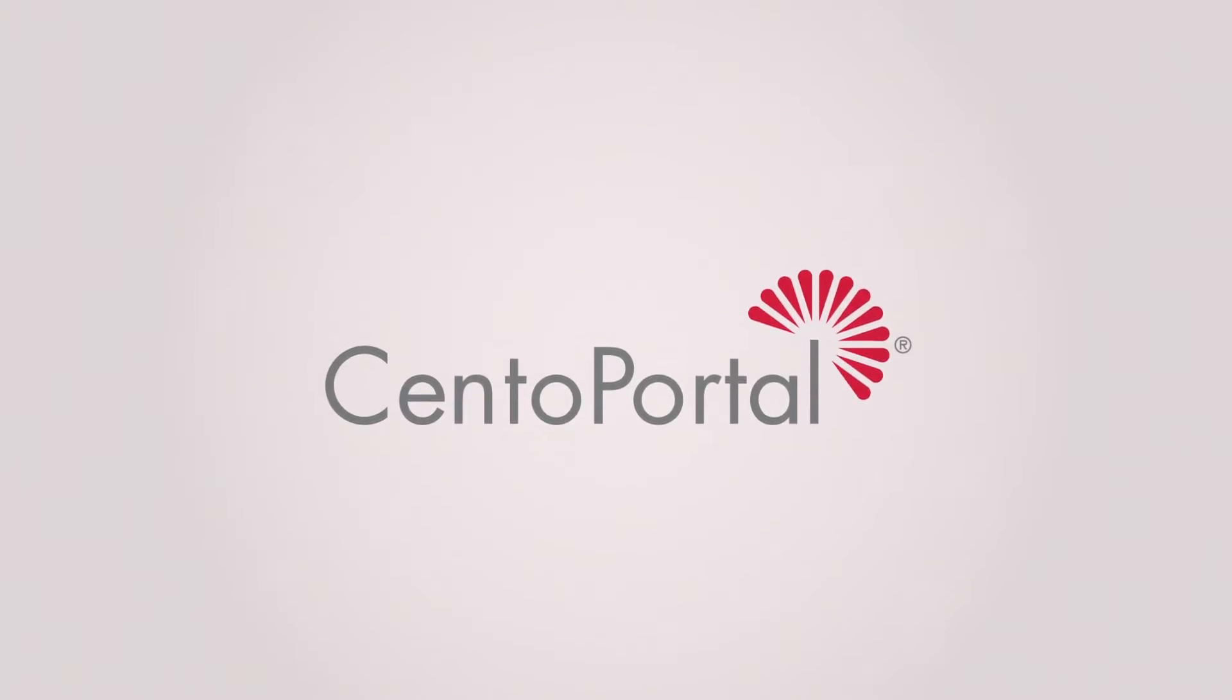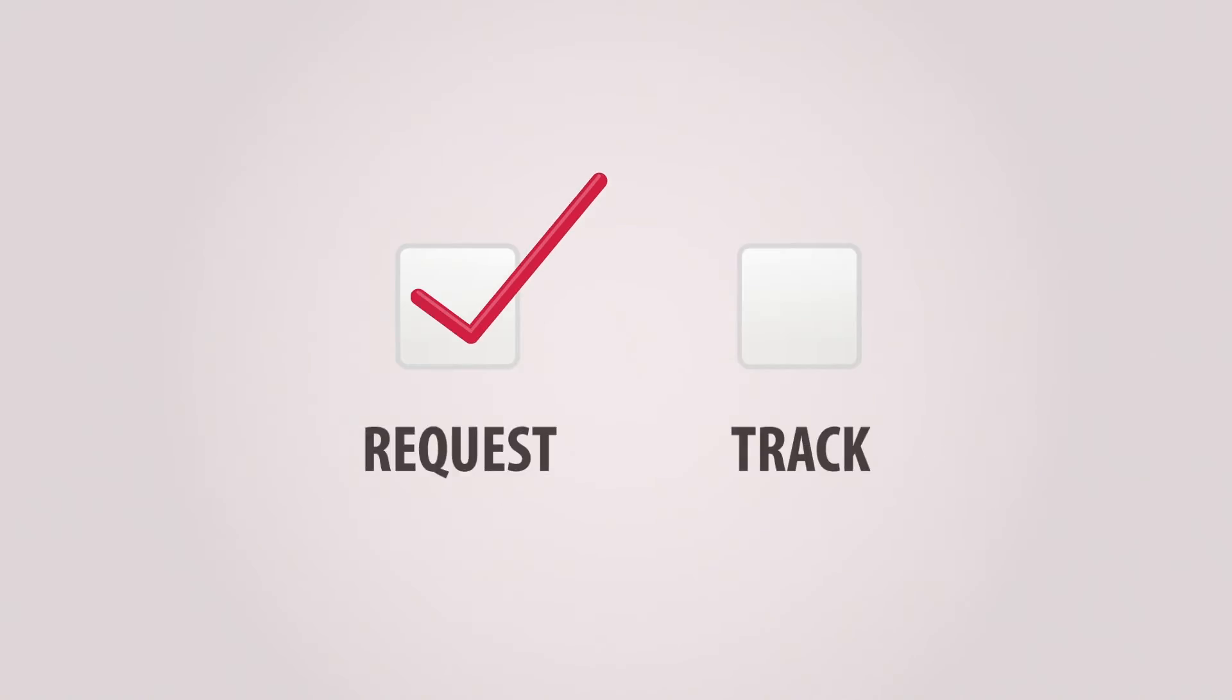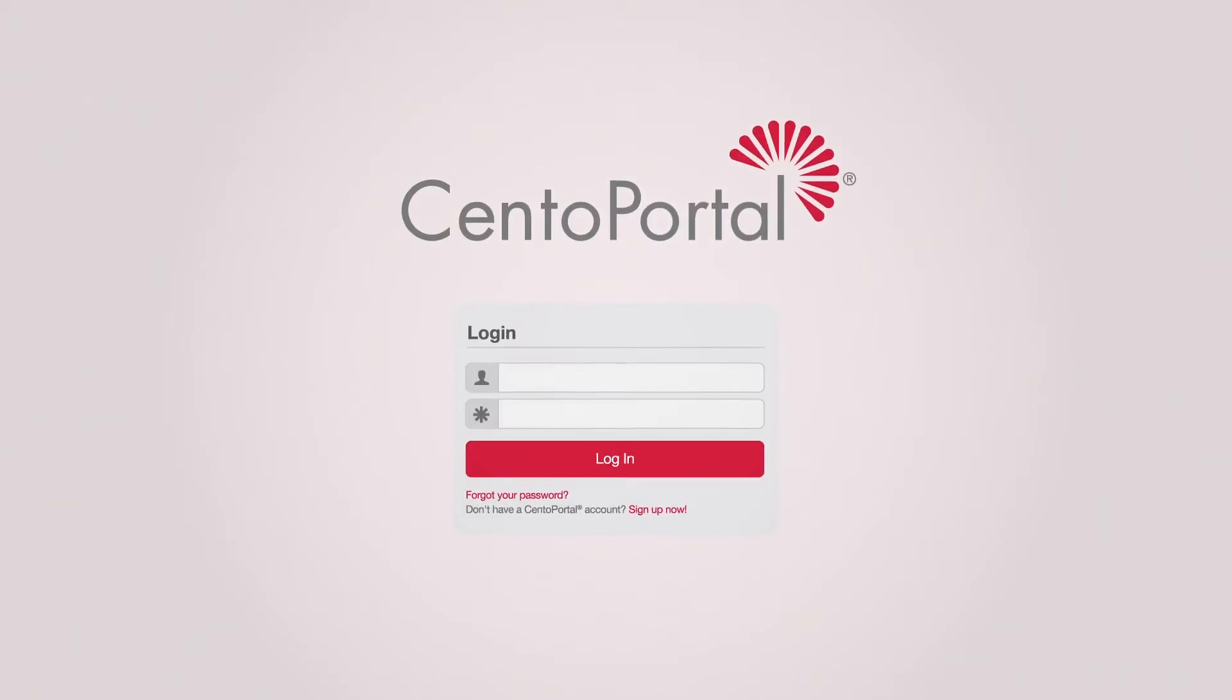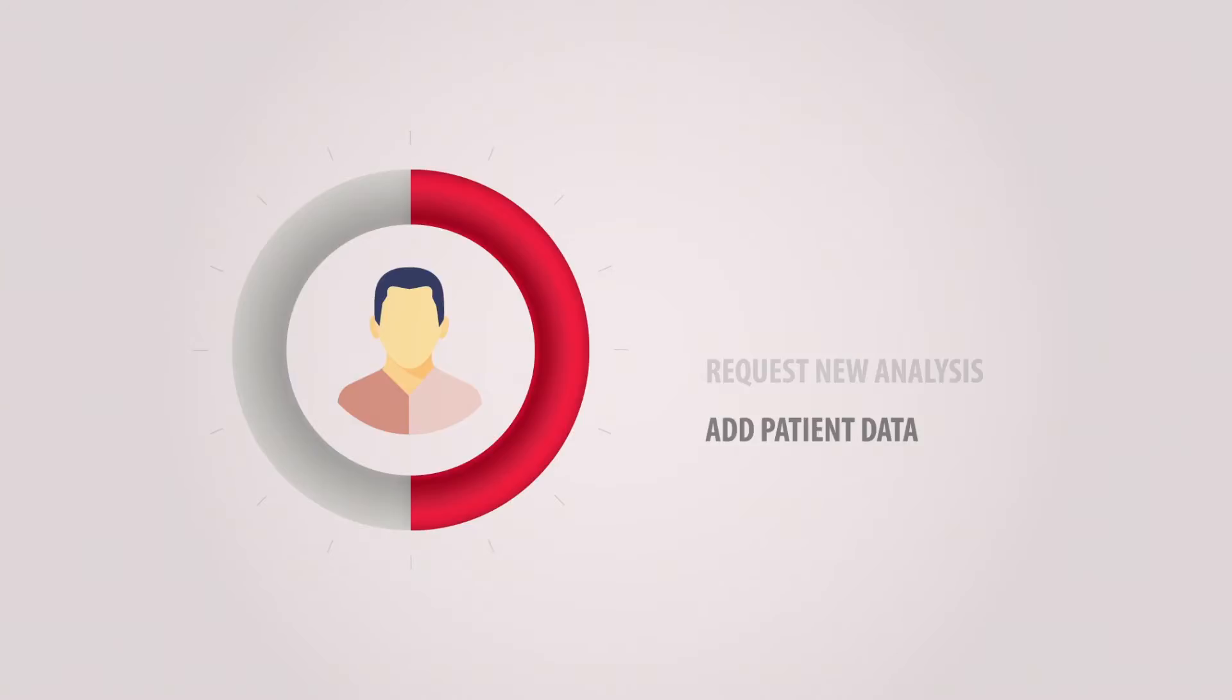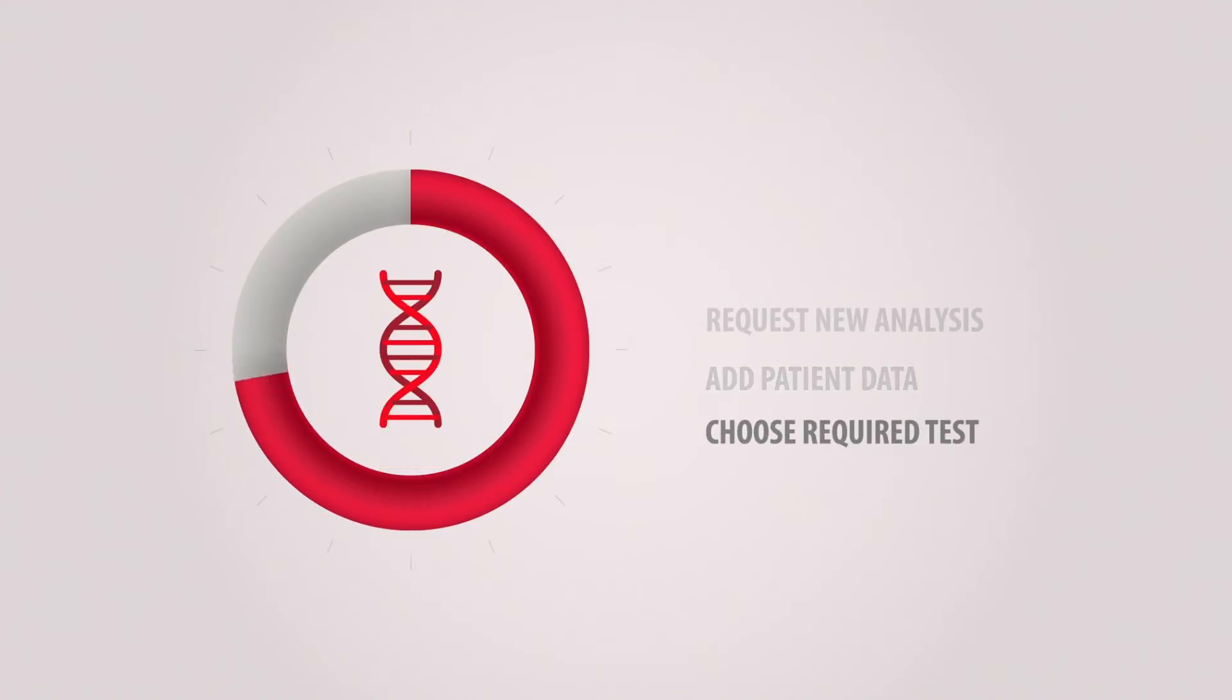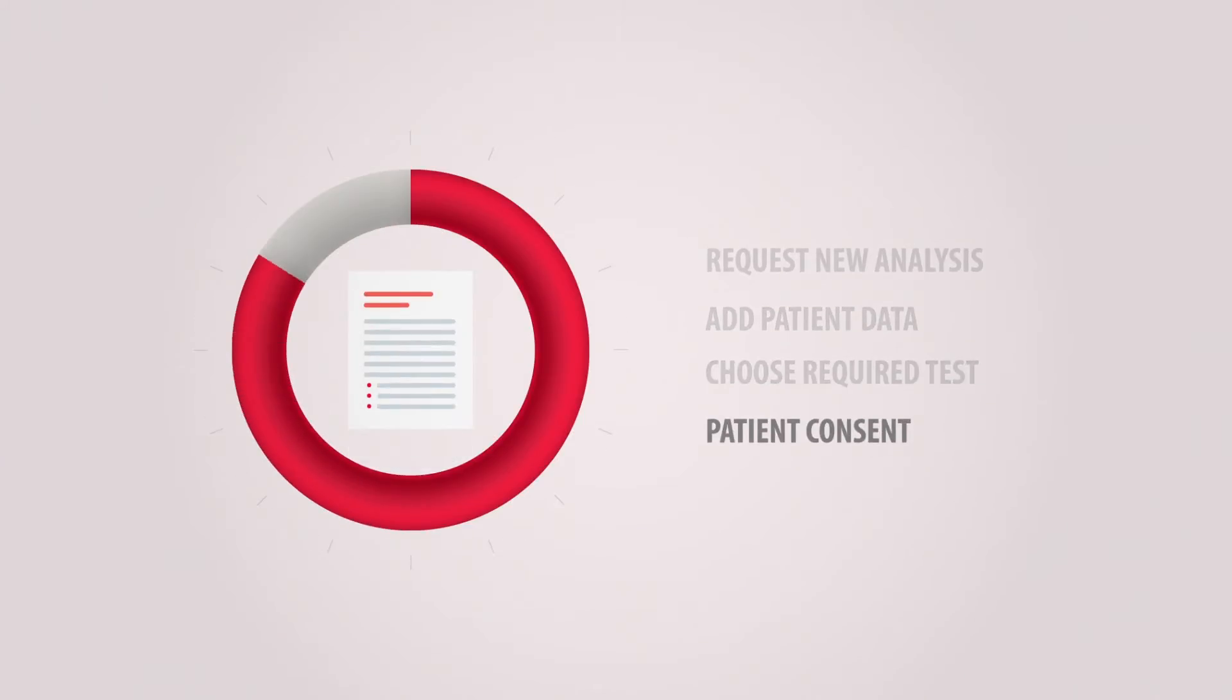With CentoPortal, you can request and track analysis in four simple steps. Log in to CentoPortal.com. Request a new analysis, add patient data, and choose the required test along with an easy online patient consent.